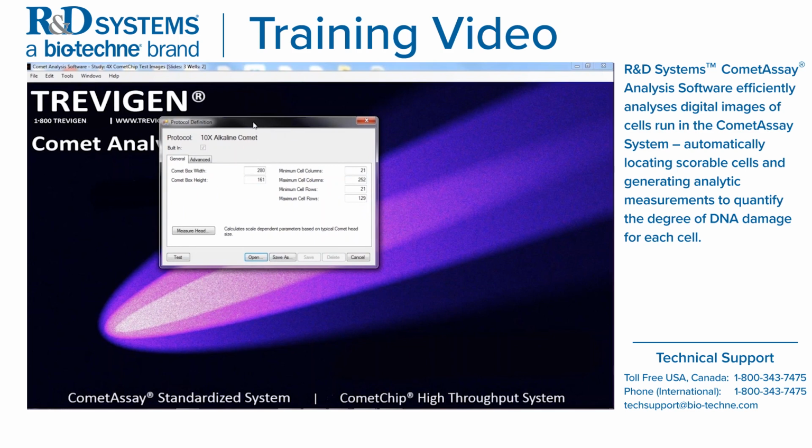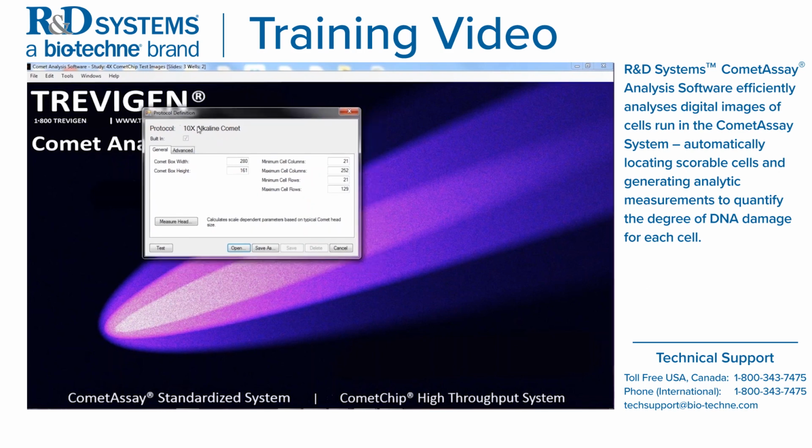So the first step you have to do in creating a new protocol, open the default protocol, any one of them. The first thing you need to do is measure the comet head on your control image. So you want a control image with no damage. You just want to measure the size of your comet head. So let's click Measure Head.